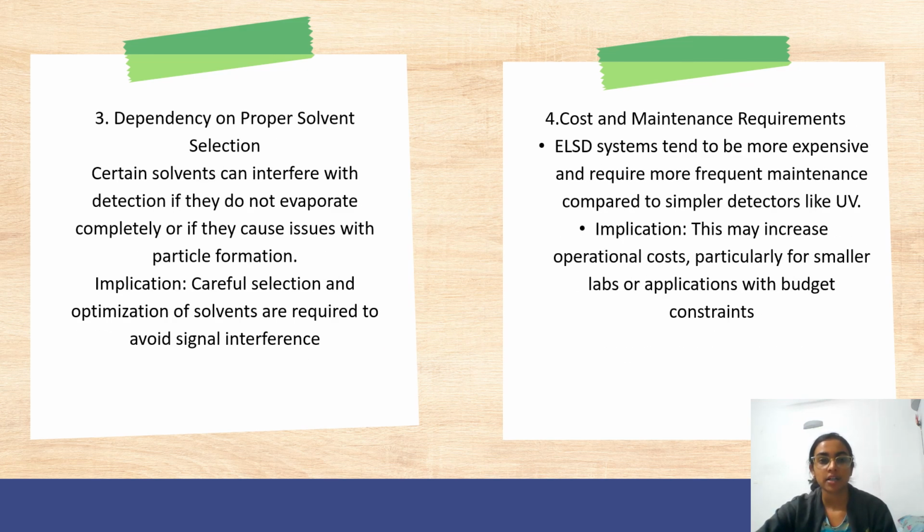Its third part is the dependency on proper solvent selection. Certain solvents can interfere with detection if they do not evaporate completely, or they can cause issues with particle formation. Its implication is that careful selection and optimization of solvent are required to avoid signal interference.